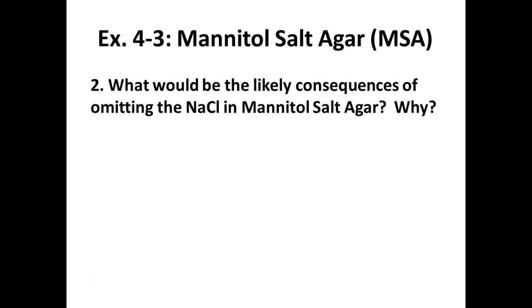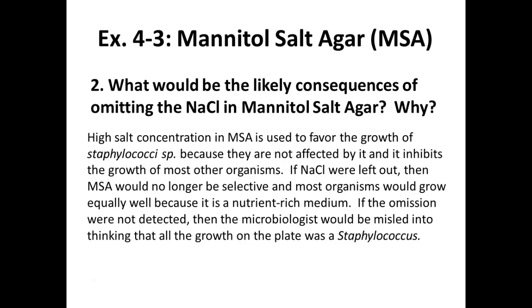What would be the likely consequence of omitting the salt? What if we didn't have any salt at all in this media? This media would no longer be what? Yeah, this high concentration of salt makes it selective. So it would no longer be selective.